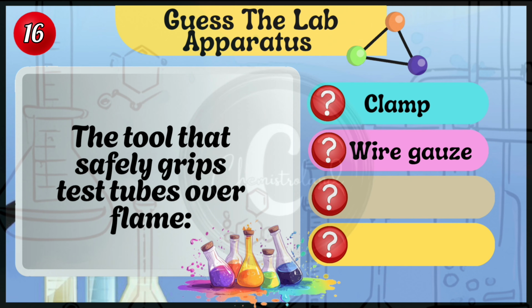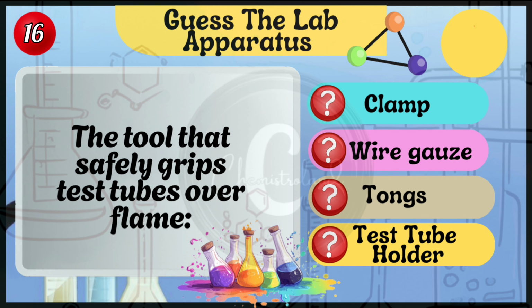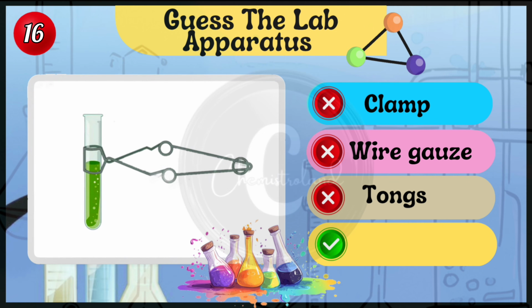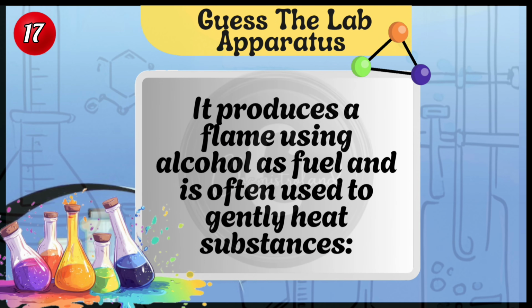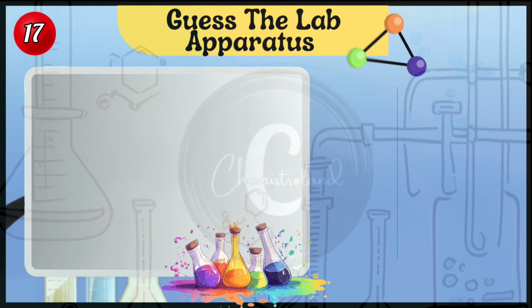The tool that safely grips test tubes over flame. Clamp, wire gauze, tongs, or test tube holder. Test tube holder.